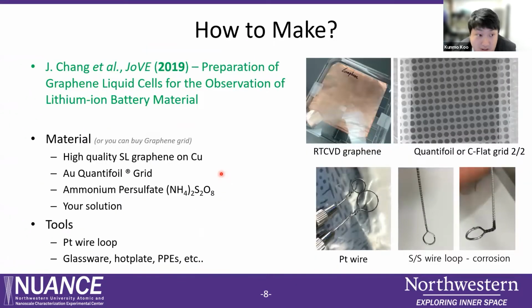So how to make the graphene liquid cell? Before we go on, I would like to recommend you to watch the movie from the JoVE article, which is published by one of my former colleagues. This movie has pretty much everything for the GLC process from scratch, and this talk today will cover the same method in detail.